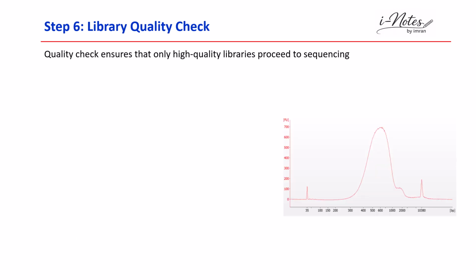So now, very important is the library quality check. Now everything is okay. You have your library, the concentration is good, so you can do the library quality check, so that you will be able to proceed with a high quality library.